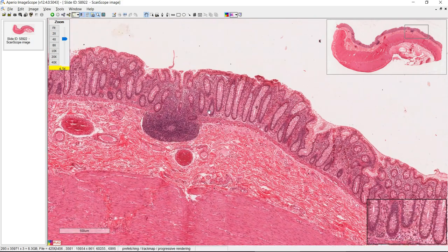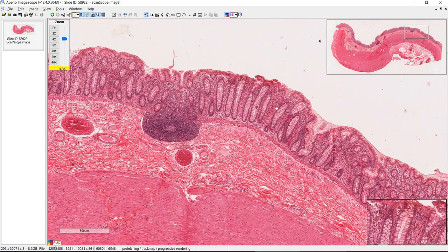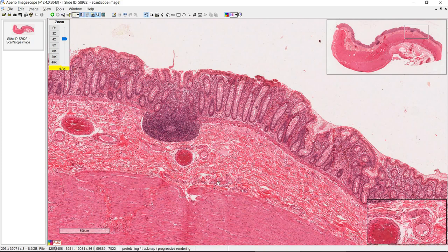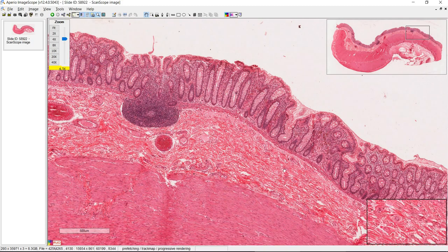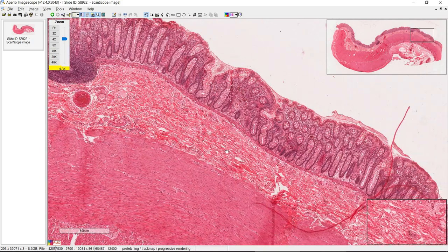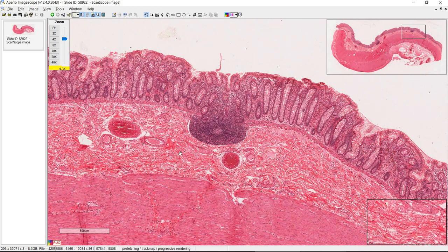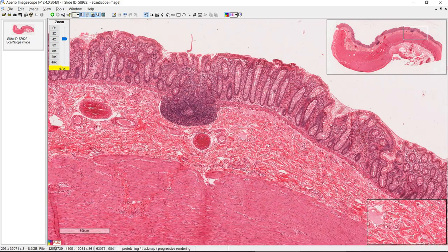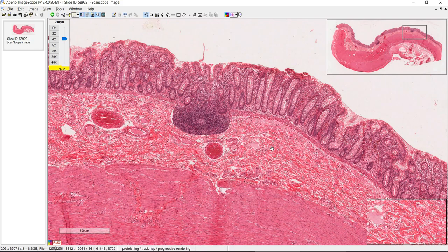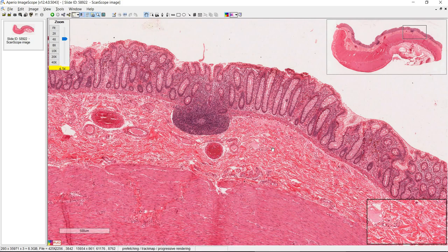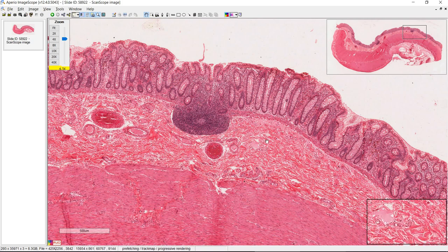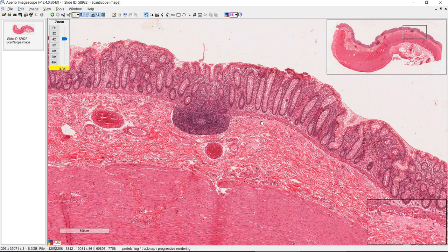You'll notice there's no villi here, and it's not like pits and glands like you would see in the stomach. The submucosa doesn't have any special features — it's kind of similar to the jejunum where it's just collagen, blood vessels, and nerve tissue. You don't have any Brunner's glands like in the duodenum, no Peyer's patches like in the ileum, and no gastric glands.